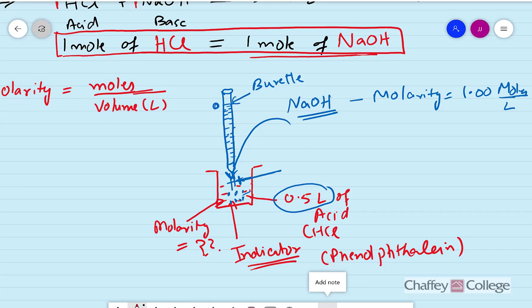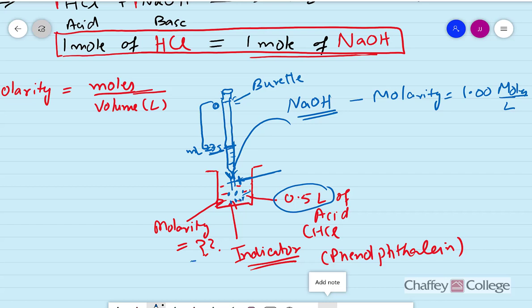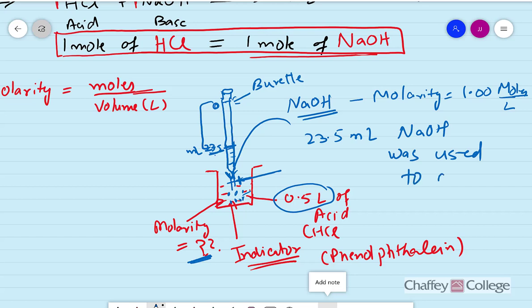We started the NaOH at 0 mL and then added it. Once the reaction was completely done, maybe we added 23.5 mL. So now we know that in order to completely neutralize our acid whose molarity is unknown, we added 23.5 mL of base. So 23.5 mL of sodium hydroxide was used to completely neutralize the acid.